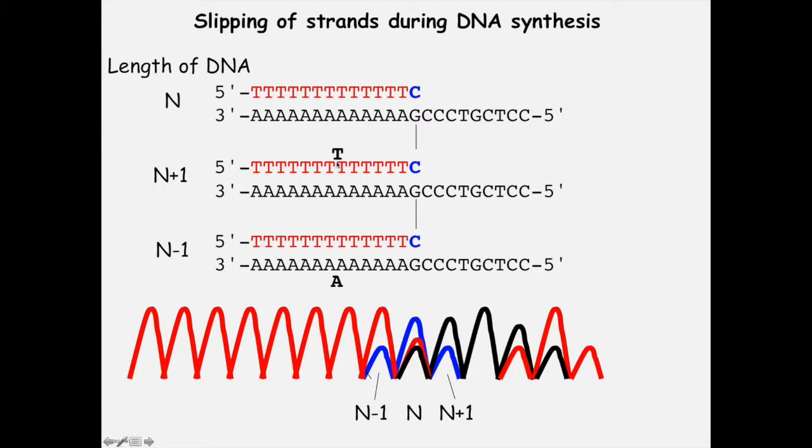Okay, so this is the correct sequence read. This is an extra T is added. And then over here, we're omitting a T. So when we get to this point where it should read the same base, there are three different possibilities because one is ahead, one is behind, and one is correct. So you see this bump ahead, the correct, bump behind.